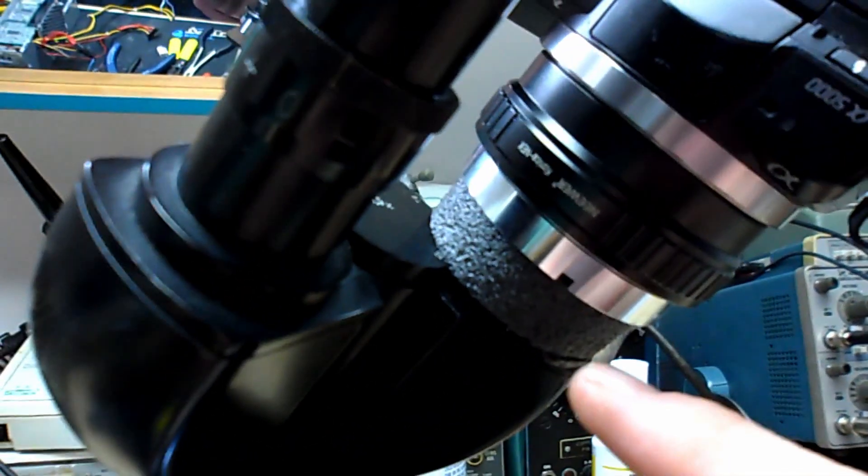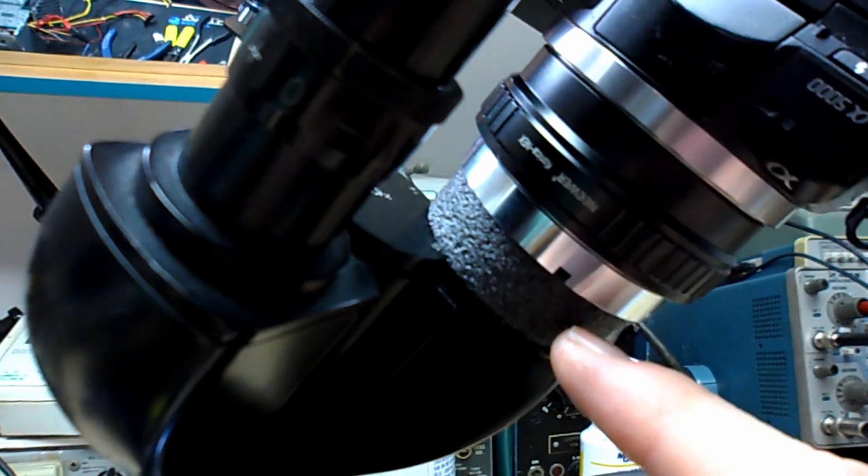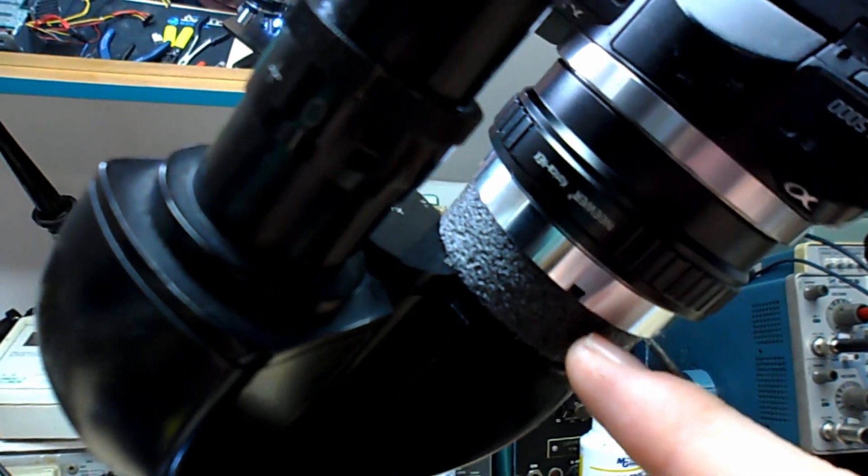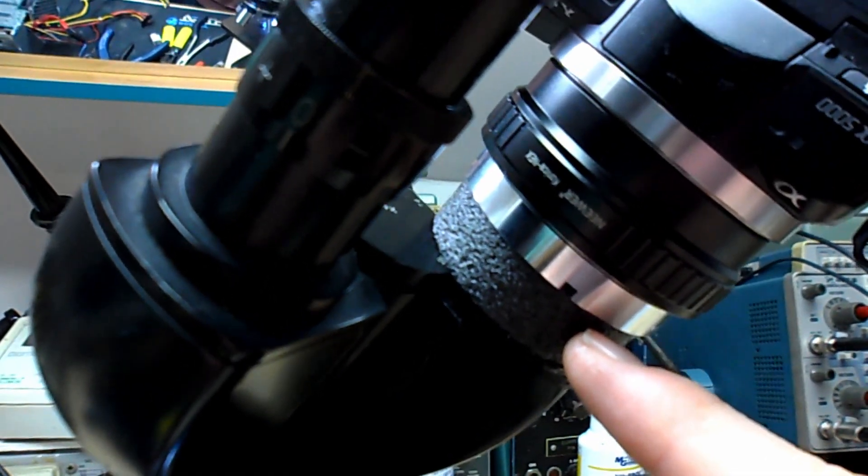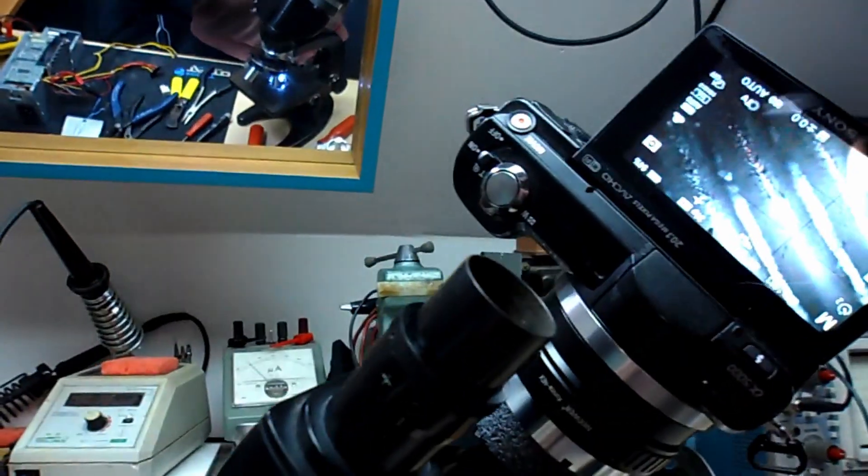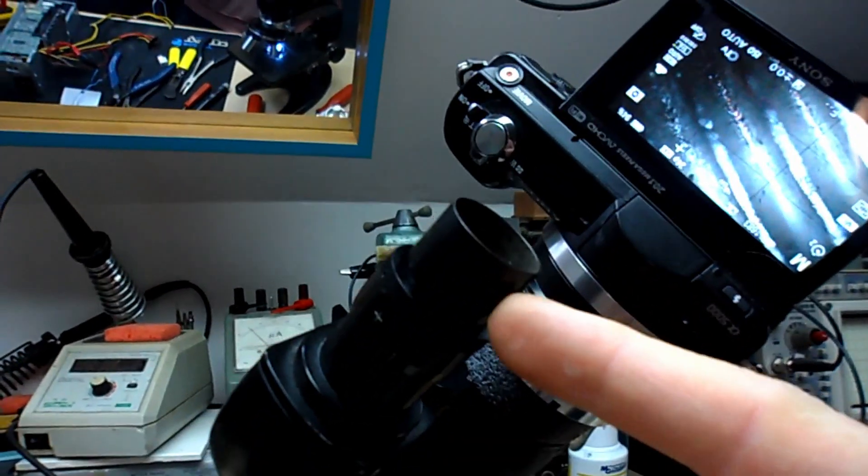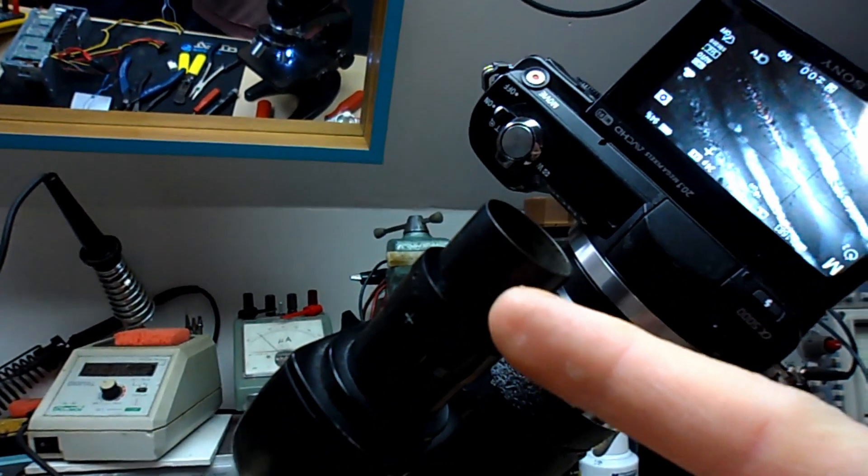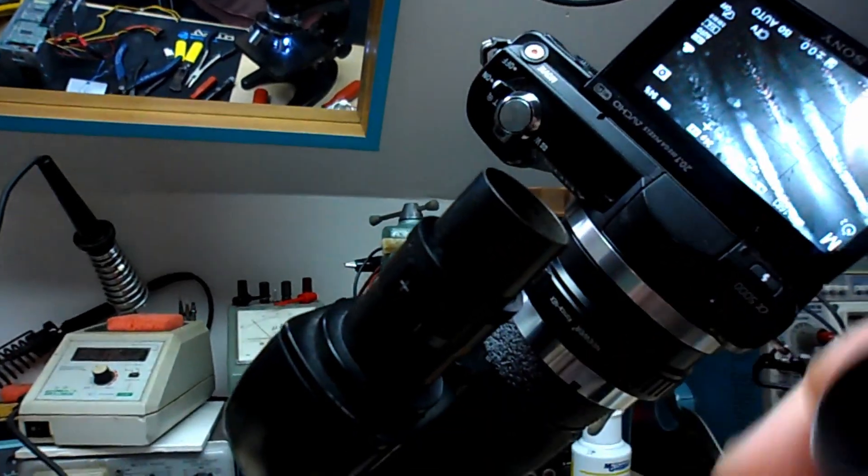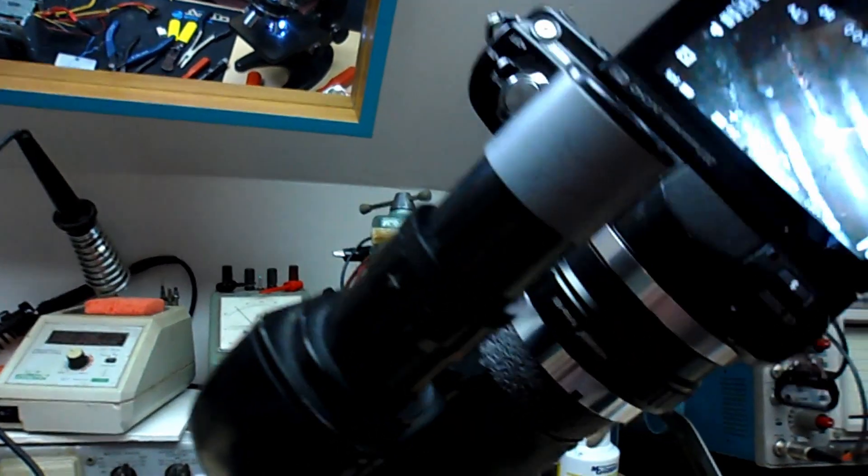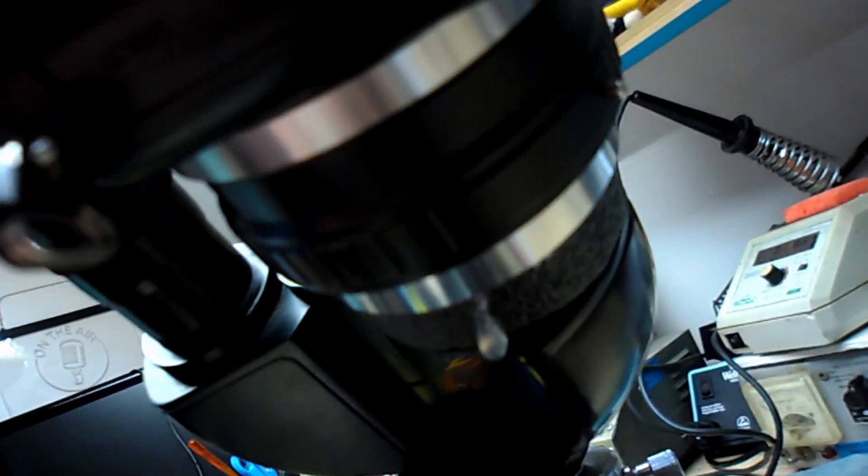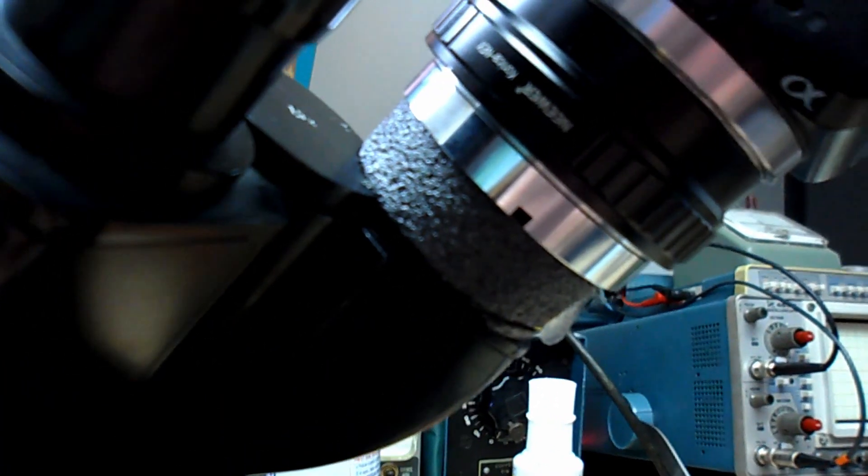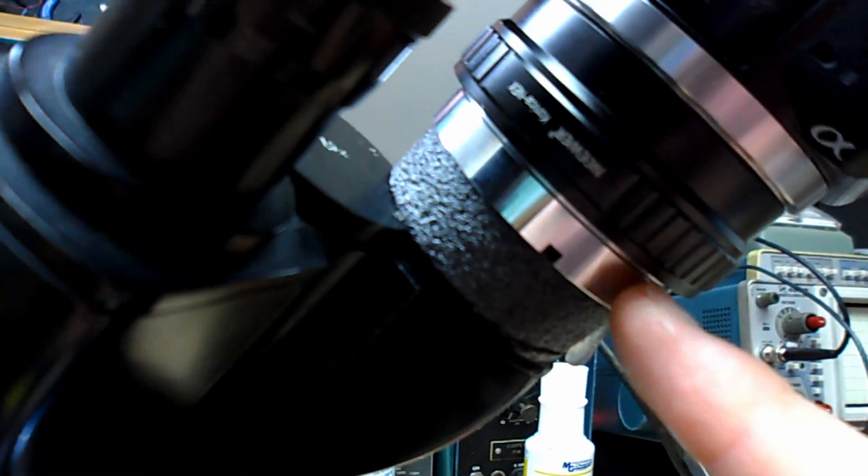What ended up saving the day is just a short section of this foam pipe insulation, which really just happened to be close enough in inner diameter to this tubing, the eyepiece tube, that I could get it around there and then through the magic of hot glue get it to stay in place.